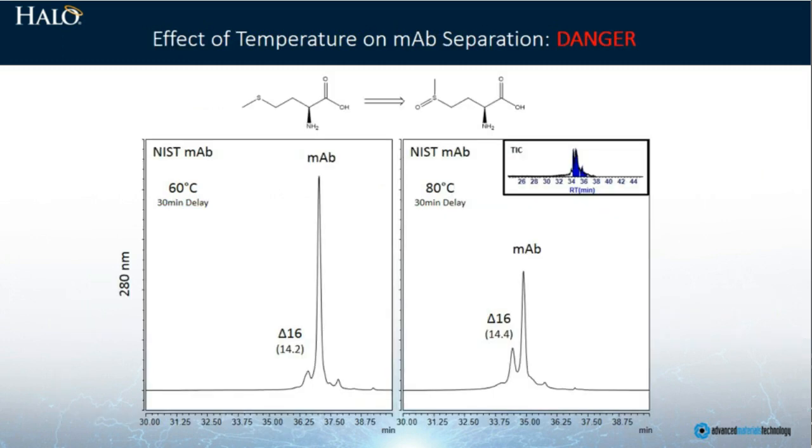When we investigated the identity of this material, it was not terribly surprising that we observed that this is a methionine sulfoxide. So we do have a time and temperature dependent accumulation of a methionine sulfoxide, and that means that as we go to increasingly higher temperatures, we must remain sensitive to the fact that there are these chemical processes that can go on, and not surprisingly, they are time and temperature dependent.